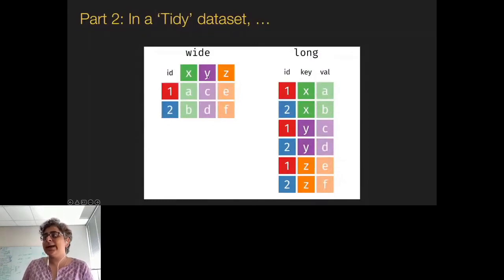So for example, this is a wide data set where you have all of these spread out, versus I can convert that into key value pairs, saying for each variable, what is the value? So I take this, for example, we saw there were 25 columns, right? And especially if you take the samples alone, they were going from column 7 to 25. There were a whole bunch of them. So there were almost 18, 19 samples alone, right? But they all have exactly the same kind of data.